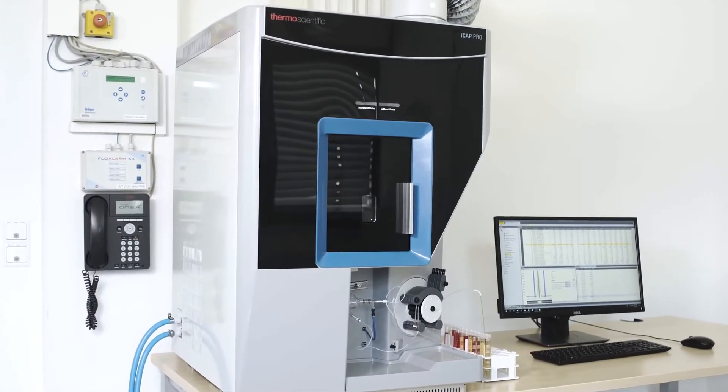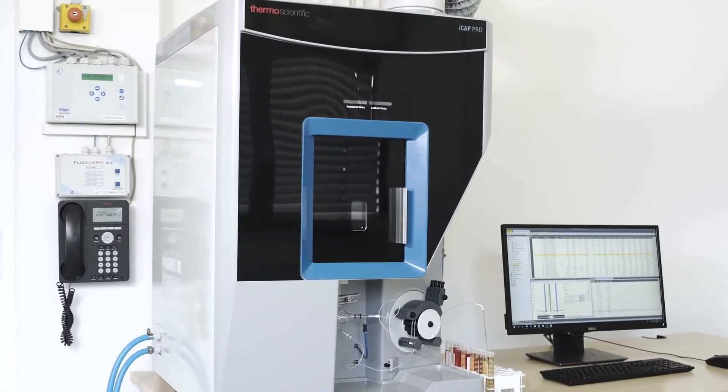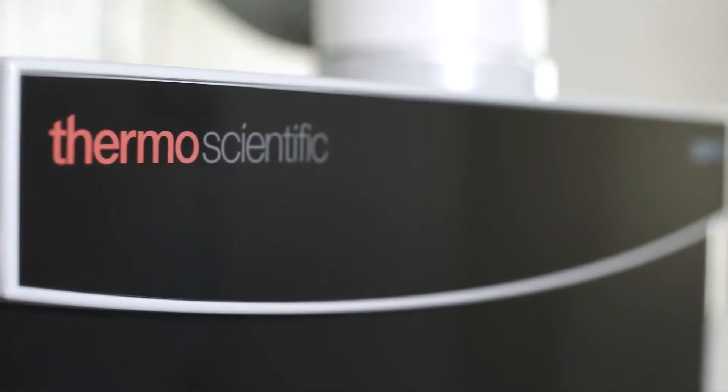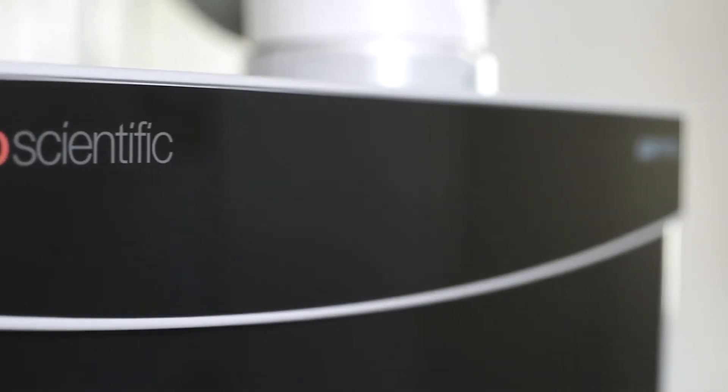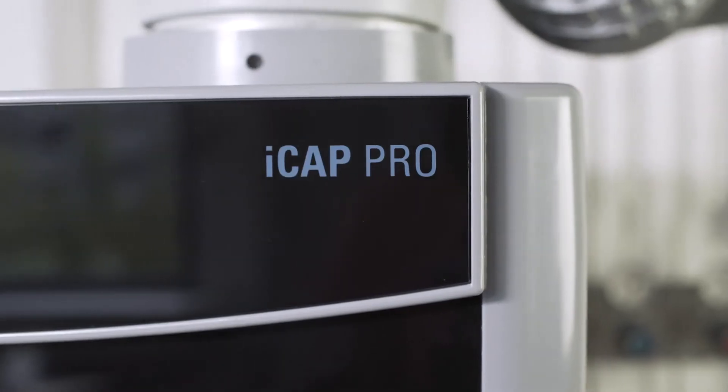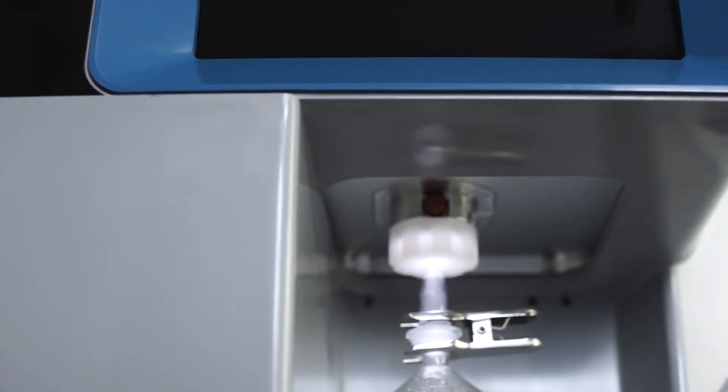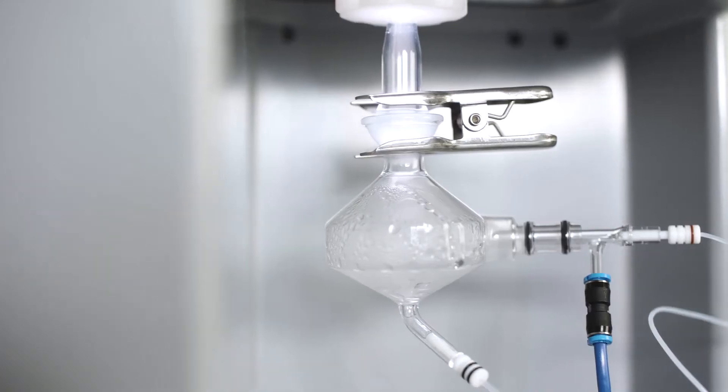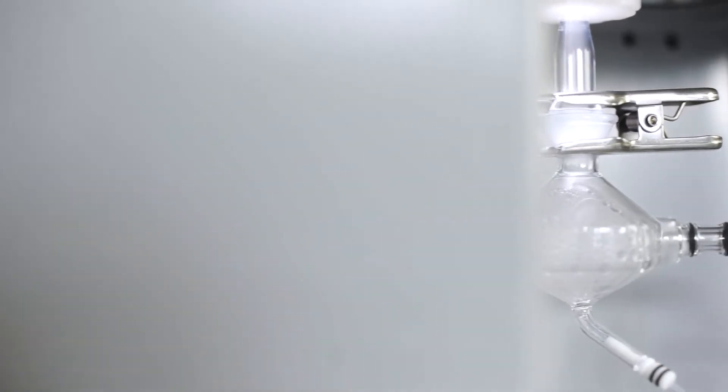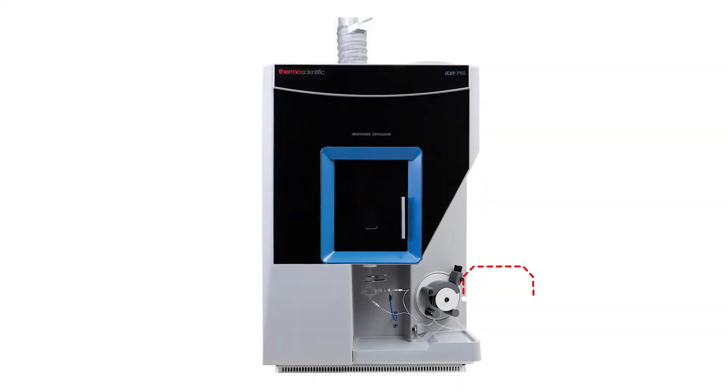Perform like a pro and win the race with robust high-speed trace elemental analysis. Discover the Thermo Scientific iCAP Pro Series ICP-OES. This powerful platform combines core technologies to deliver the ultimate ICP-OES analysis.